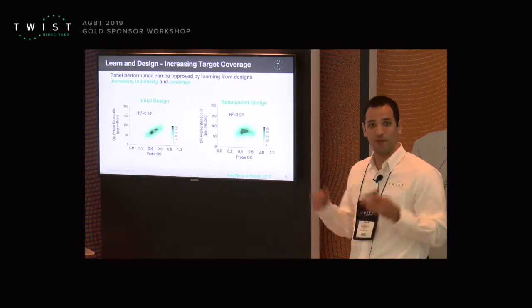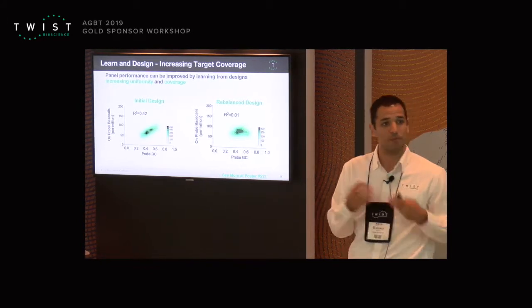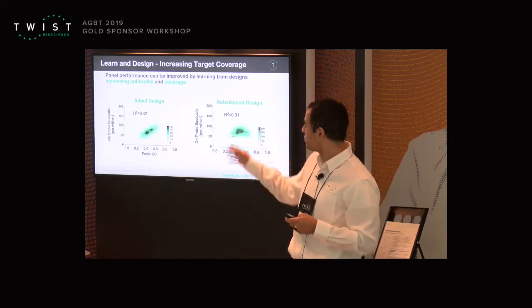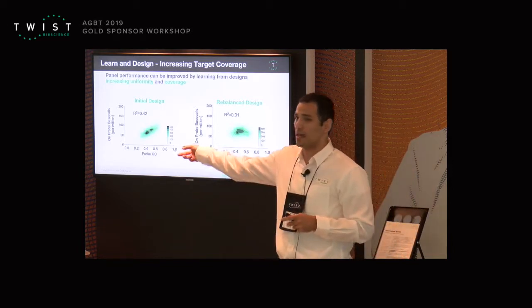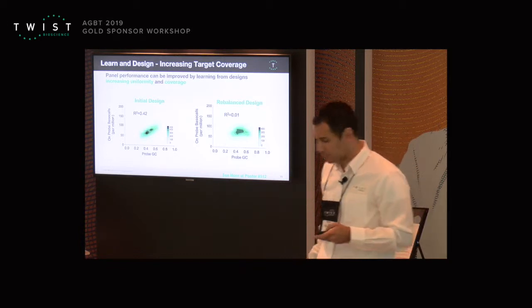And we've done it before. We've done it to get to where we are in terms of the panels we make, and make sure they're good on a first pass. And so we ran it through our algorithm, and we got the great uniform capture, as expected, no GC bias. This is iteration 1, iteration 2 on a fast turnaround platform. It's pretty good and expected.